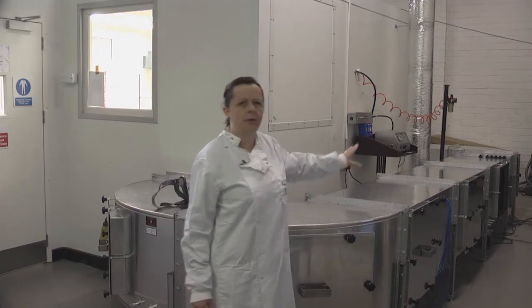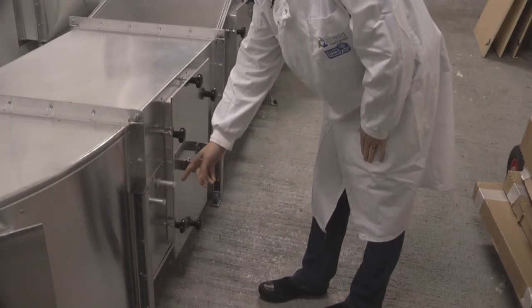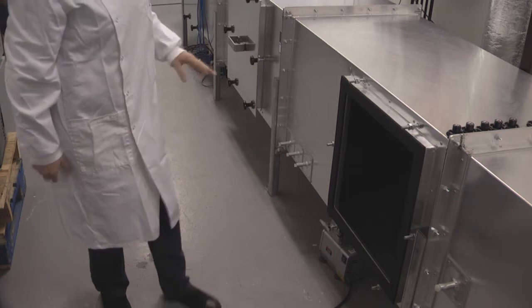As you can see on the test duct, there are a number of doors at the sides which are sealed with gaskets. These can be removed to enable sample collection systems to be put in, and also for cleaning down the duct after testing. We can also attach air cleaning devices into the duct.